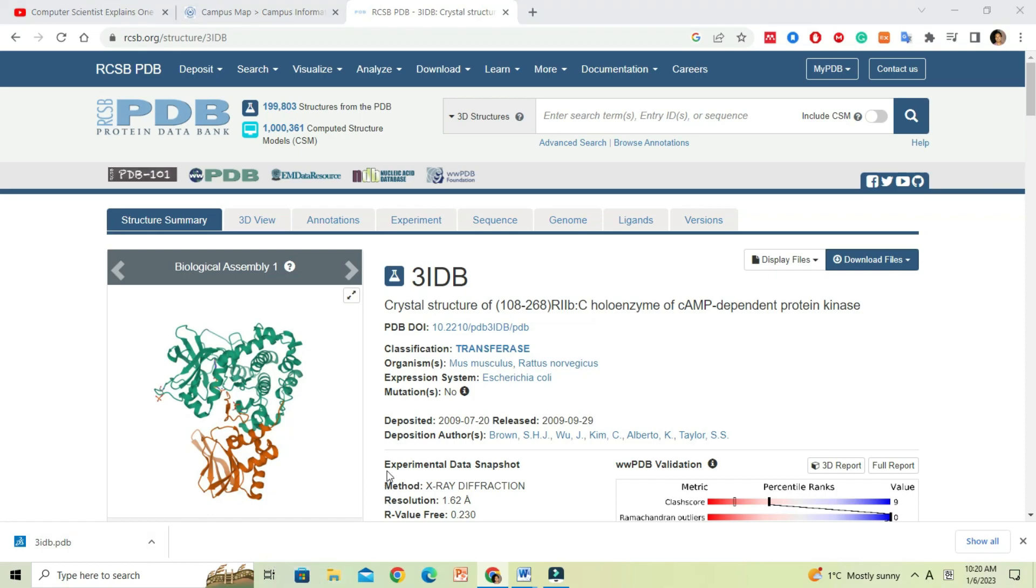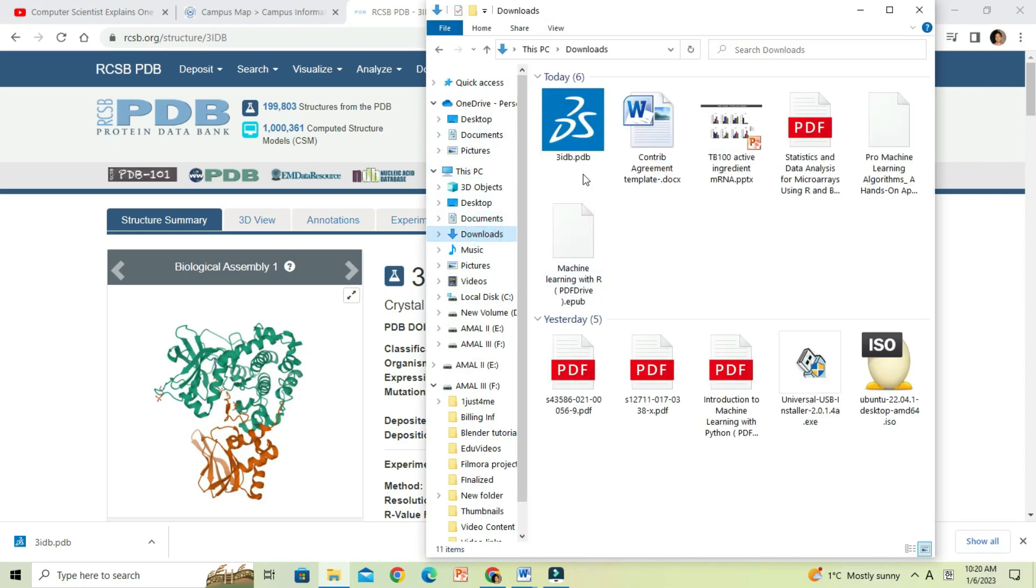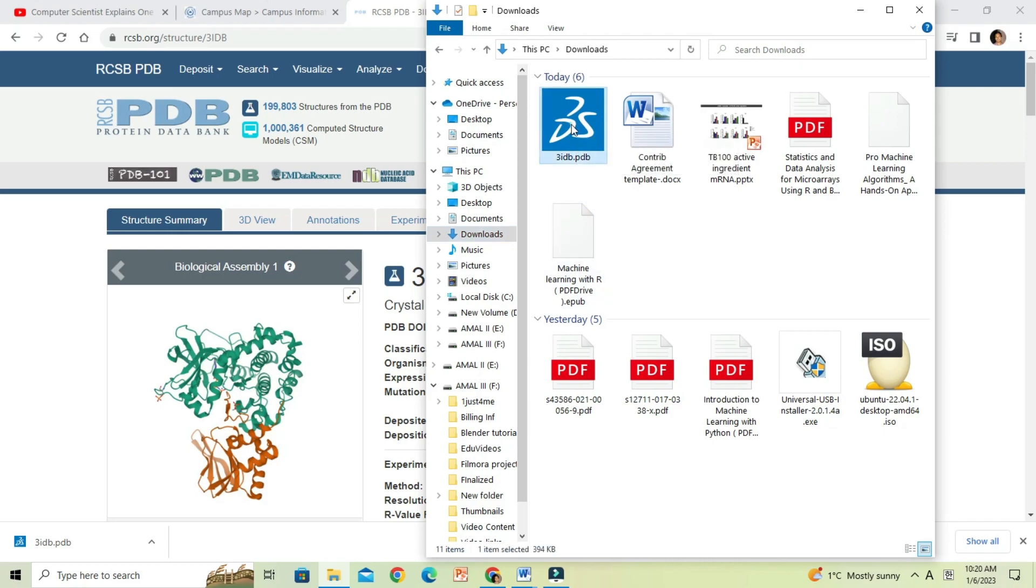For easiness, I will cut and paste the PDB file into a folder in the desktop, which I named as molecules.